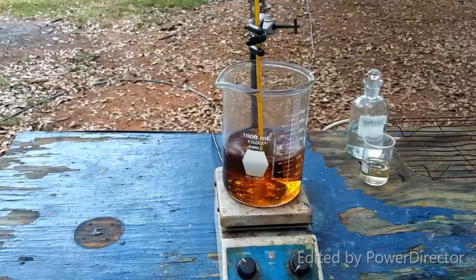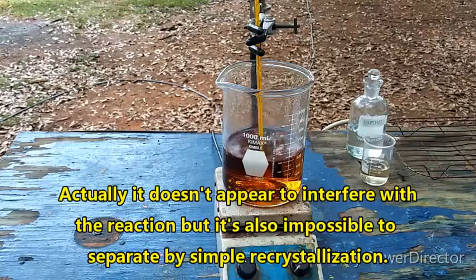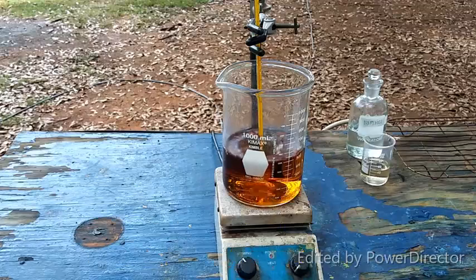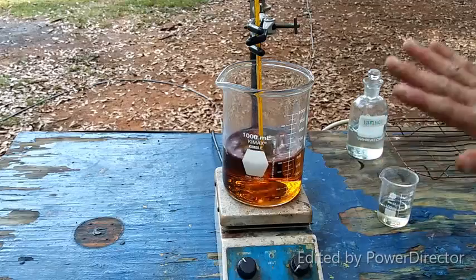Something else that's in there. I don't know that it's going to interfere or not. I'm not sure. But since everything's going much better than yesterday, we're just going to continue. So the next step now is, and like I said, I'm not screwing with this. I don't even care.